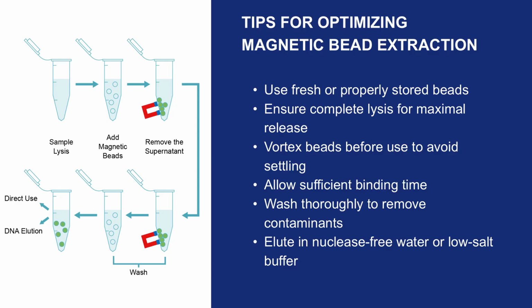Allow adequate binding time. Use enough washing buffer to remove impurities. And elute in a low-salt, nuclease-free buffer. These steps help prevent loss of nucleic acids and avoid carryover of inhibitors. Let's move on to some additional tips for RNA-specific extraction.